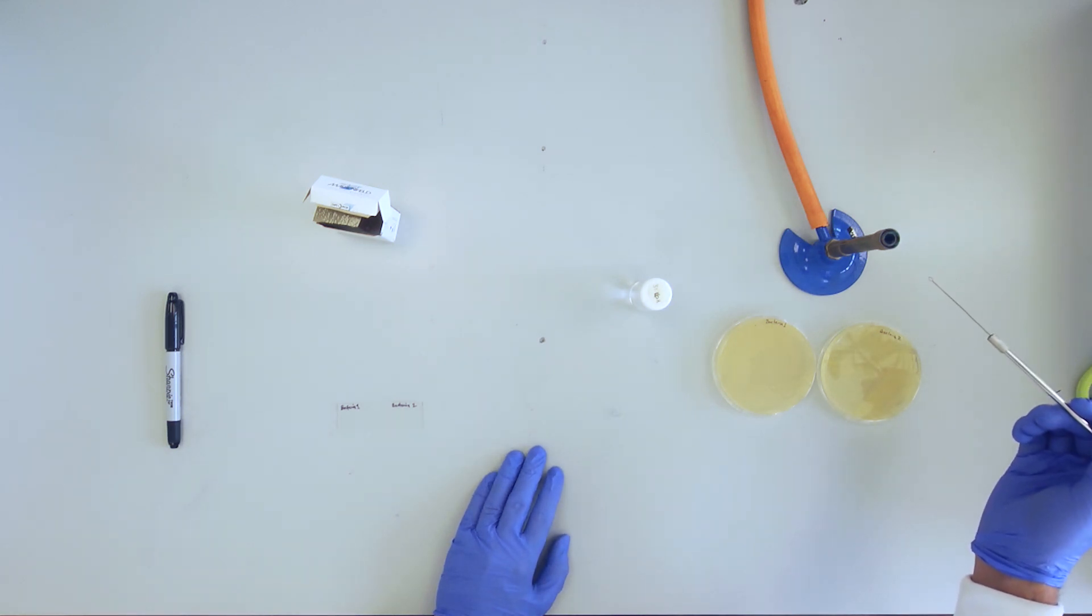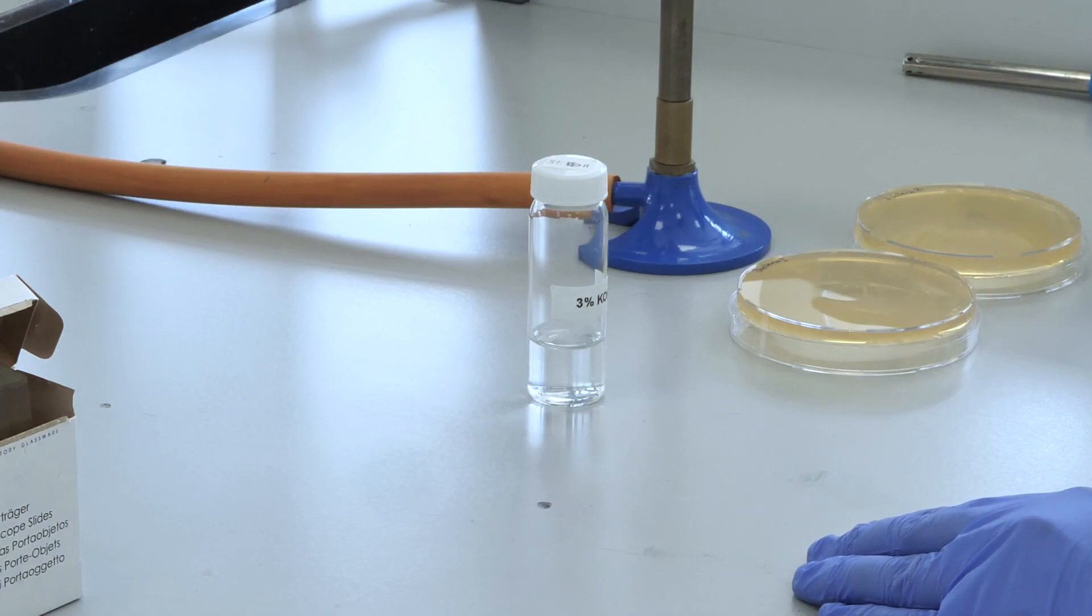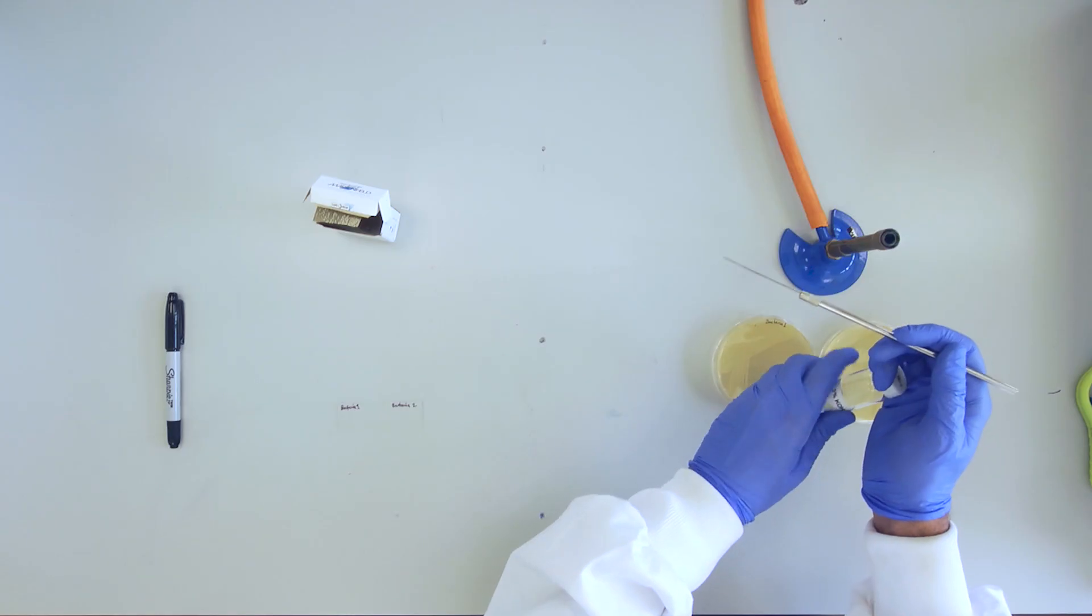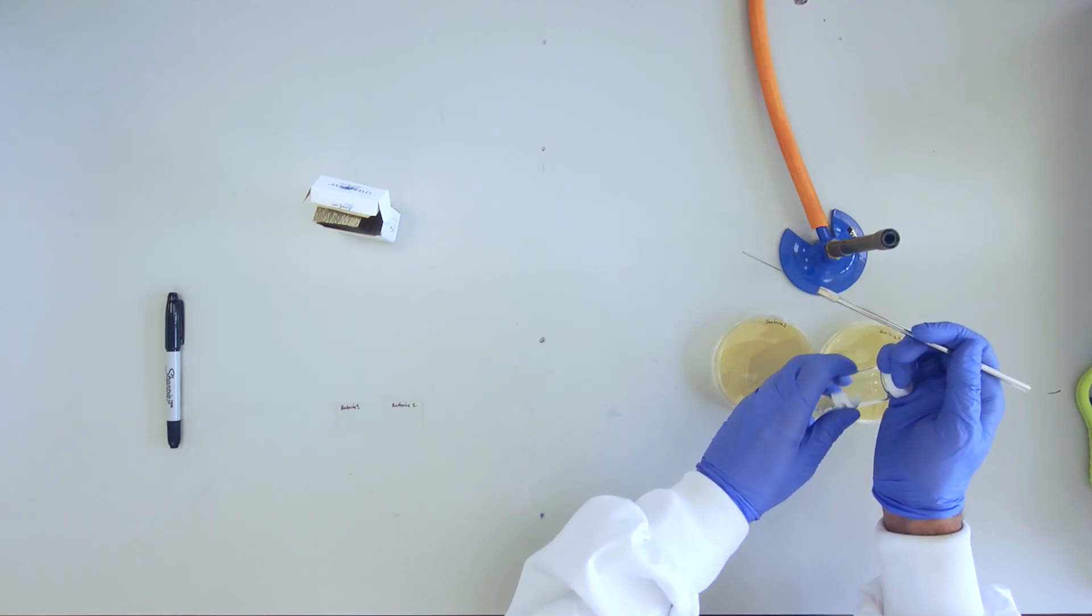Using aseptic technique, place a drop of 3% KOH below each label using your sterile loop.